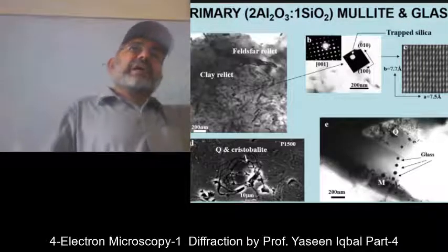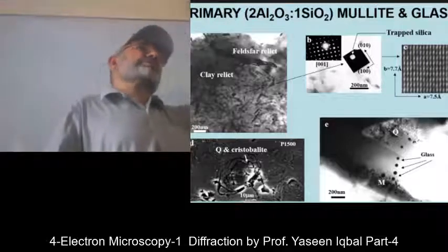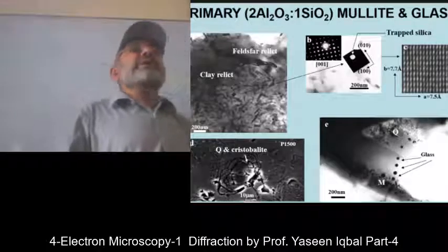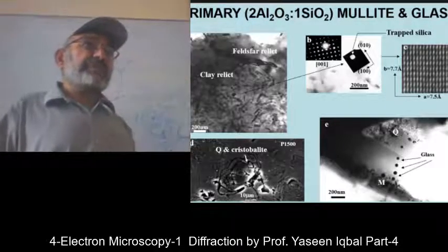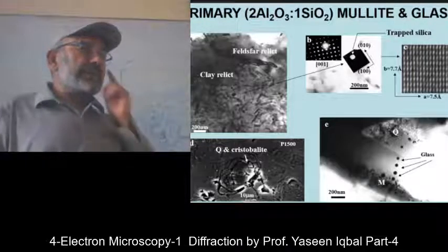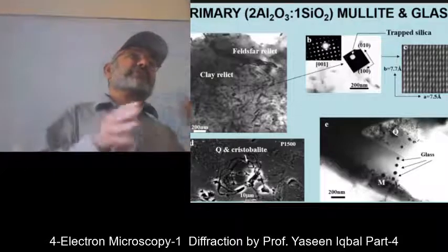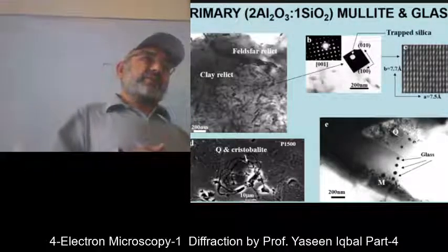The other may be at 010 axis if it is a polycrystalline material. So you can take the images along different direction and you can combine them to make the holistic picture of the material.